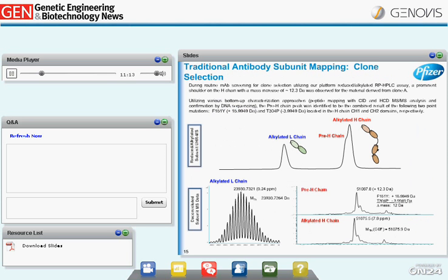Here we show the traditional antibody subunit mapping without using a FabRICATOR or the Maxis mass spectrometer on the heavy chain. You can see on the bottom trace that for the light chain, we do get monoisotopic resolution. However, for just the heavy chain, using a high-resolution mass spectrometer, we're not able to get monoisotopic resolution or have a confident mass spectrum for the given heavy chain.